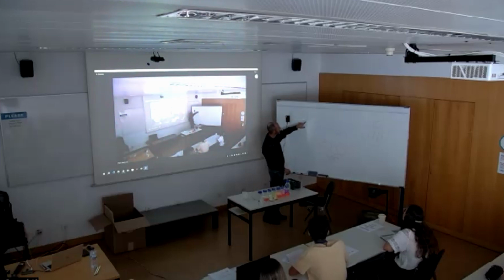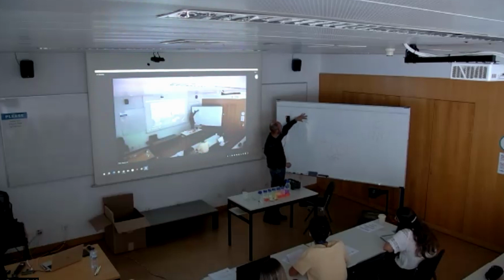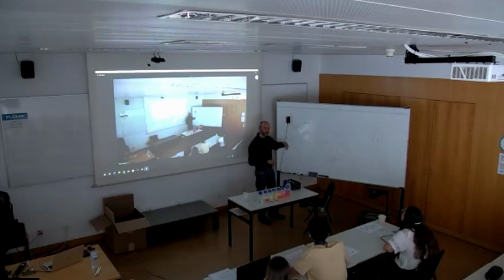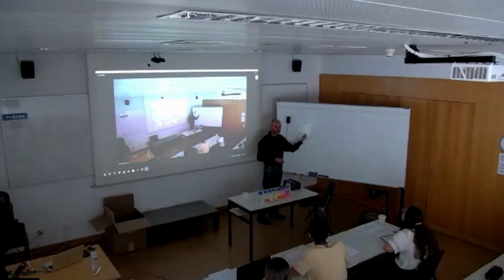So the angle of the light that passed from glass to air is larger. So the exiting angle, called angle of refraction, is larger than the angle of incidence on the surface. And it depends on the angle. How much larger it is, we still don't know, it's related with the angle of incidence. But if I increase this angle of incidence, the angle of refraction becomes larger and larger until light travels parallel to the surface of separation, and then it disappears completely, and there is what is called total internal reflection within the medium with higher refractive index. Is it cool? Okay.